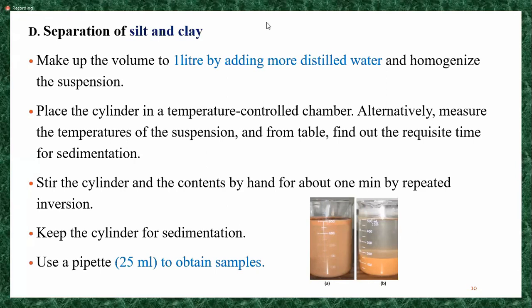Yeah, very good. 4 minutes and 10 seconds. After 4 minutes and 10 seconds, you can observe the silt will sediment. With the time factor, we are going to determine the texture. Right, settling time. Can you tell the settling time for clay? 6 hours and 56 minutes.